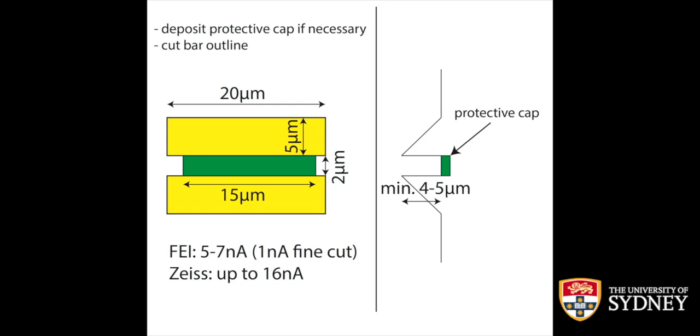But using the electron beam and water vapor, if you've got water vapor available, or in the FEI system it's called selective carbon etch, you can actually fully remove the carbon that you've deposited, and that's a very handy method of producing high quality samples from relatively difficult samples.